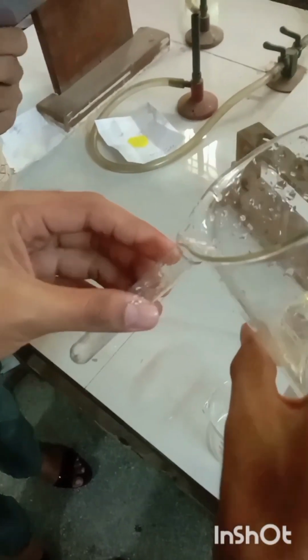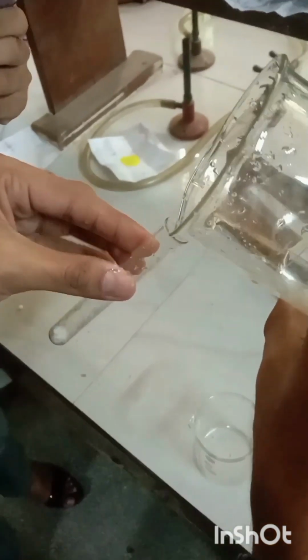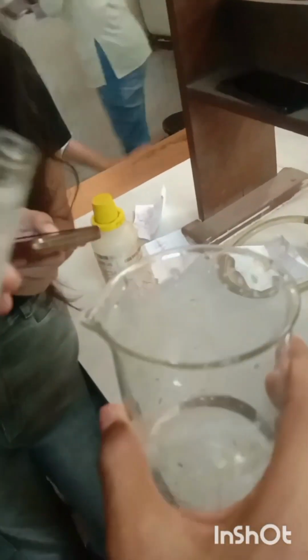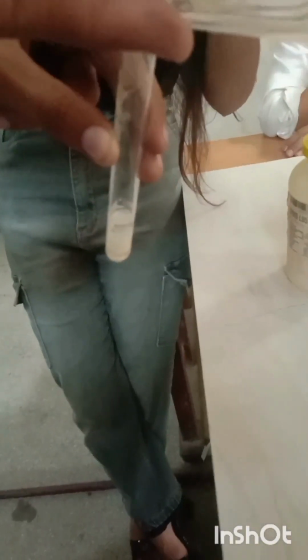First of all, we will add the solution of ammonium acetate in this test tube containing insoluble, and then we will add this dilute acetic acid or the glacial acetic acid solution in this test tube, and we will heat the solution thereafter. If the compound or the insoluble gets dissolved after heating, if it is soluble, then maybe the lead sulfate is present.